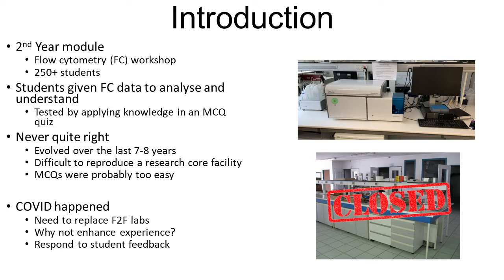Now, we have run this sort of session for 8 years as a data analysis workshop, but it was clear that we've struggled to reproduce the research environment, and that student feedback suggests that seeing a flow cytometer in action is needed. Indeed, the more we reflected, the more we realised that the multiple choice quiz was also probably too easy. So COVID has pretty much just allowed us to re-evaluate and redesign this module with a more appropriate learning and teaching resource that we would like to talk about now.